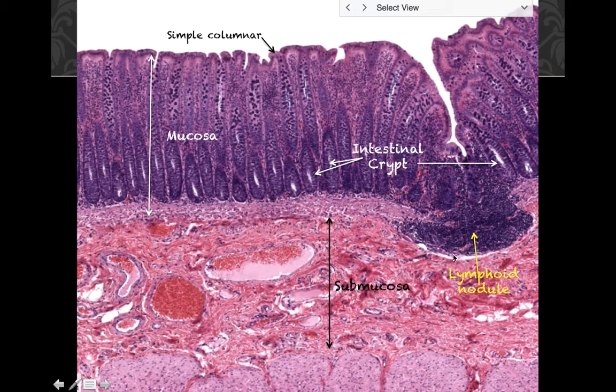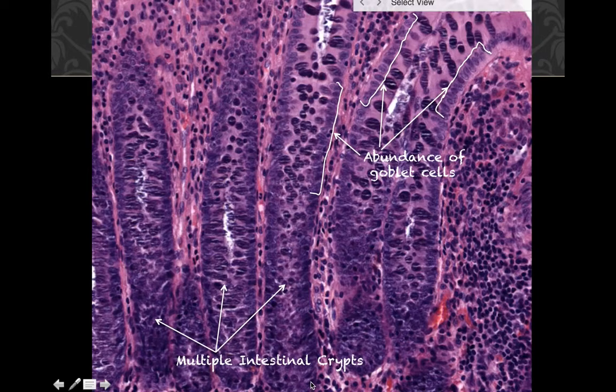This would be one lymphoid nodule. Lymphoid, I keep saying lymphoid. This is that submucosa. The lymphoid nodules are actually in the mucosa, so same with the Peyer's patches. It makes sense that they're in the mucosa, the white blood cells need to be activated. So the submucosa is right here. And then that's muscularis externa.